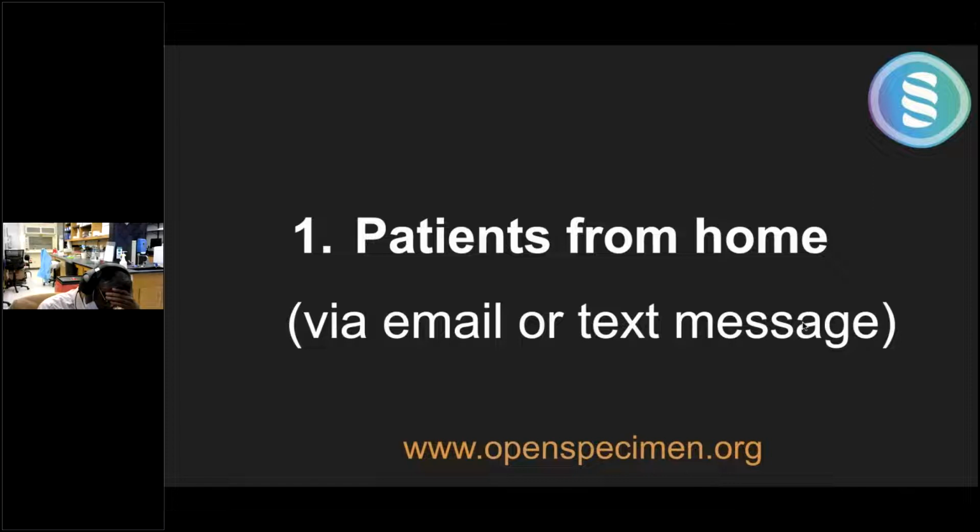So you would create consent forms in OpenSpecimen. Obviously you need the email ID of the patients, but once you have that, you can just send out the surveys or the e-consent forms for the patients to fill from home. They would get an email with the URL, click on it, and finish the consenting process.